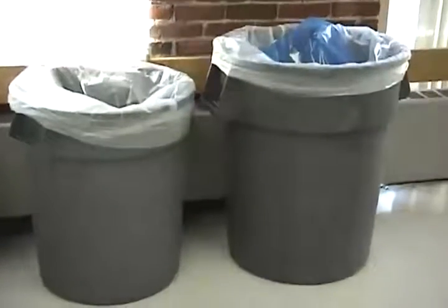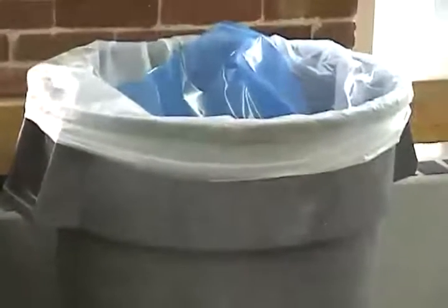Paper Trash. Paper trash goes in the paper trash receptacle only. This includes paper, plastic bags, styrofoam, and other soft compressible items that do not puncture a trash bag liner.